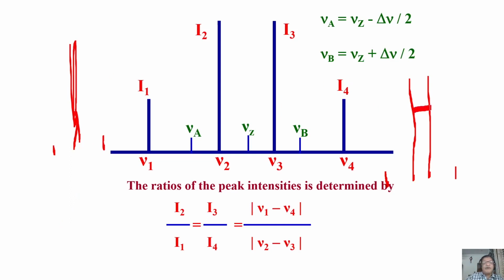Another interesting thing happens. This separation keeps on coming down. That also happens. The separation between the internal peaks keeps coming down. And the separation between the internal peaks and outer peaks keeps on increasing. Very interesting phenomenon.